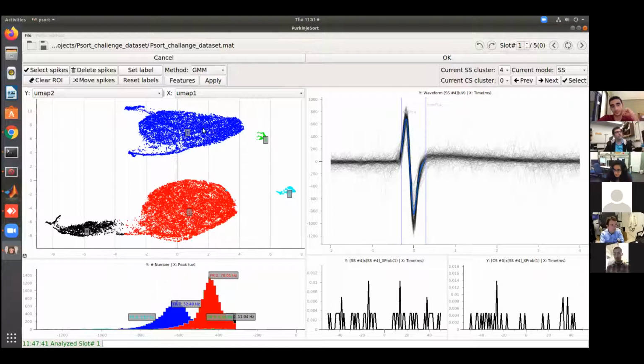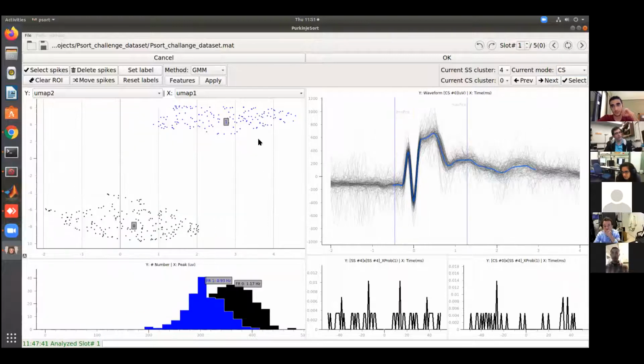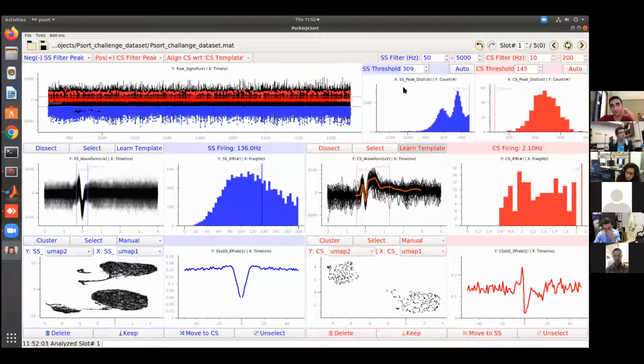So although I have assigned all these labels, and now I have a very good idea about what is what with my simple spike and complex spike, if I hit OK, all those labels are gone, and in the main window, where things matter, I just have one label for complex spike, with 2 clusters, all of them complex spike, and everything here is again simple spike.